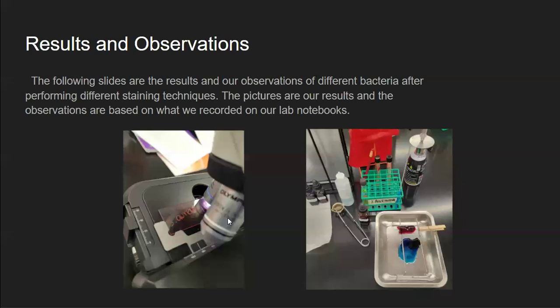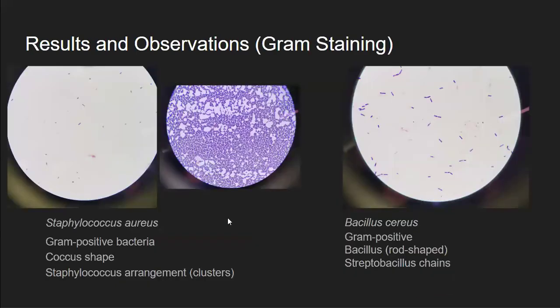Results and observations. The following slides are the result and are observations of different bacteria and performing different staining techniques. The pictures are our results, and the observations are based on what we recorded in our lab notebooks. Gram staining.